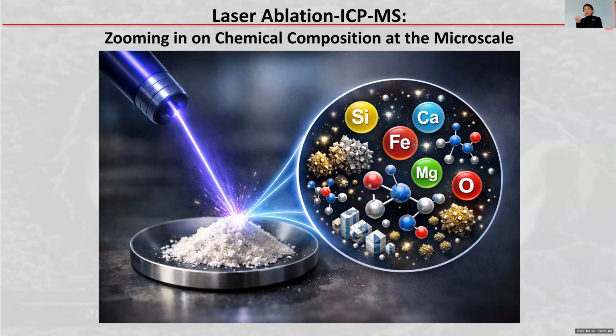Not because it's wrong, like ICP-MS cannot analyze oxygen because the ion source is under atmosphere, but because there is a method, laser absorption, that is specifically for oxygen. So I thought the scary part is not that AI can be as wrong as us, but that it can get as confused as us. So thanks.